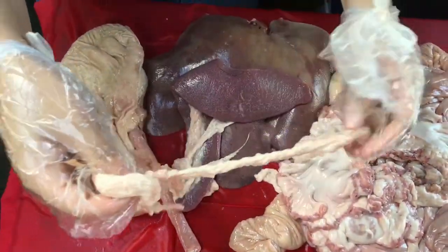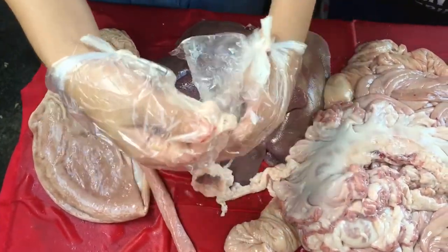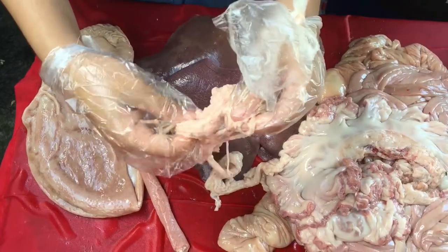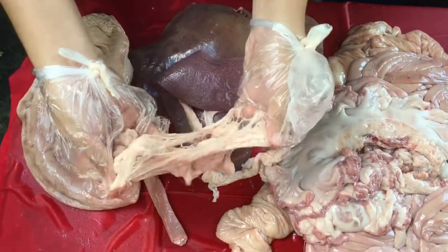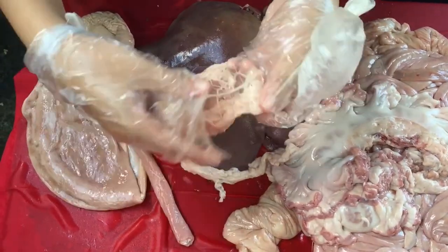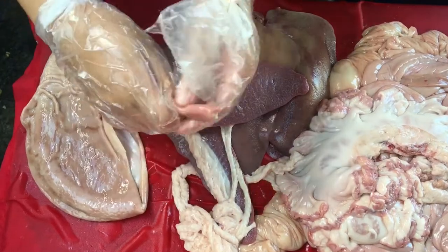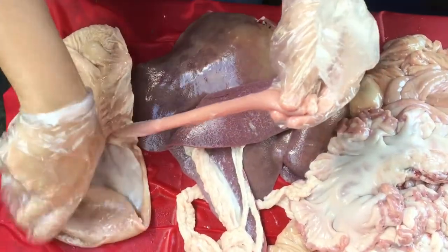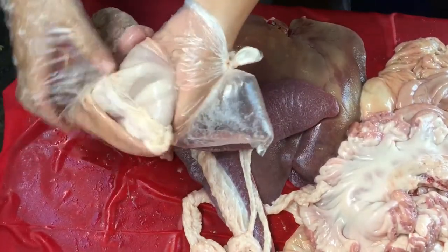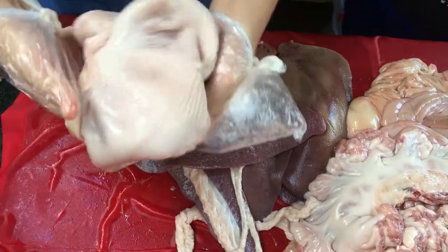The omentum is a very loose membrane, but it's the way the stomach is attached to the body wall along the backbone, or the spine rather. The omentum is one of the main places that the body stores fat. And as you can see how the esophagus enters the stomach, let us split the stomach and see the parts of a stomach.